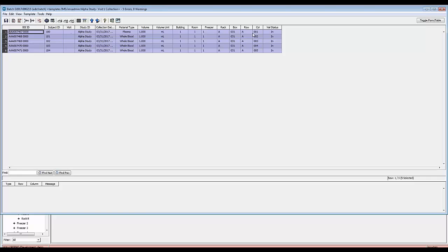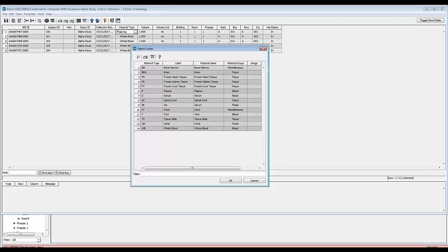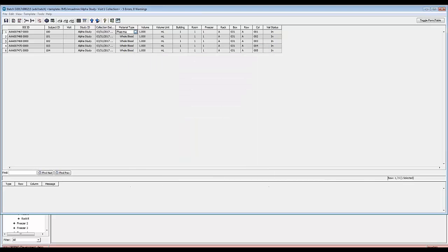You probably have noticed there are many different types of fields in this batch as well. For instance, this code list field. This field is linked to a list of accepted vocabulary for this field. So if anyone enters a value that is not a part of this list, that value will remain in error. Users who have the appropriate permissions may configure and edit this list. Users may also define their own field types and add the errors to them by using the customization module.